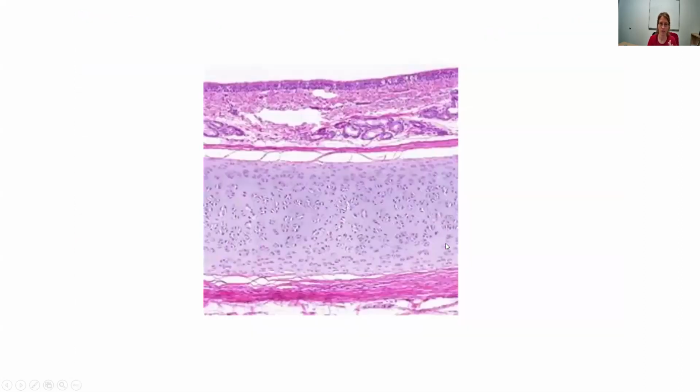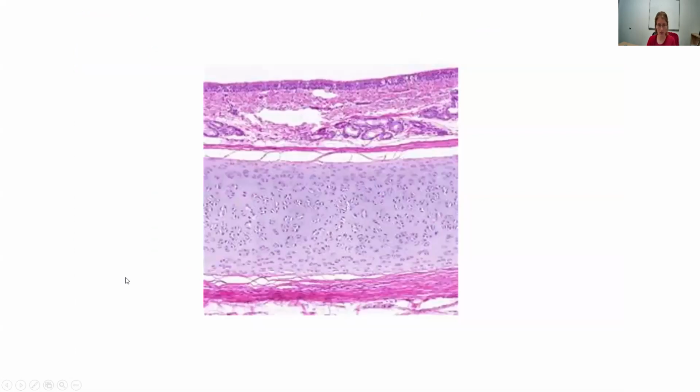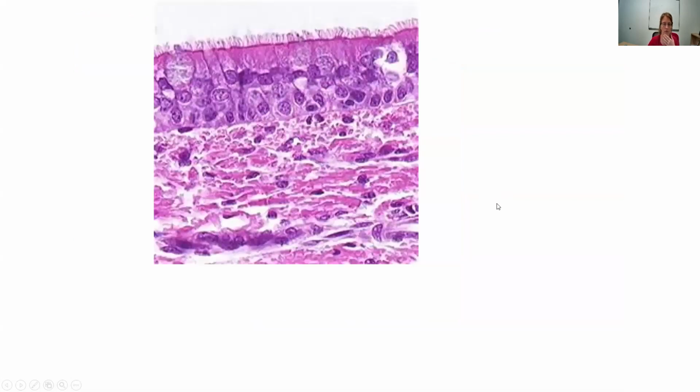All right, next slide. So this is basically that same thing, just from a little bit further away. The hyaline cartilage you can see in this one, it's a slightly different picture, but you can see there's that smooth matrix. This is actually a terrible picture. We're skipping it. Okay, here is just this part. So just this edge part and this little bit of this.